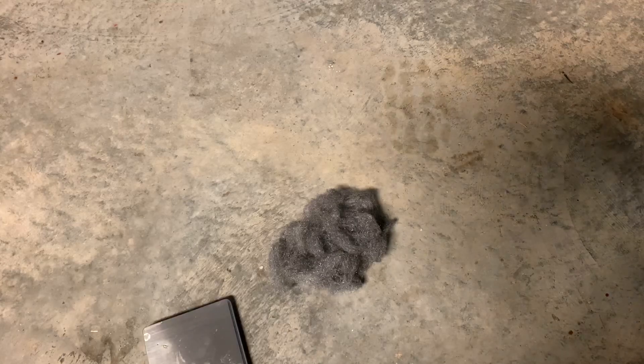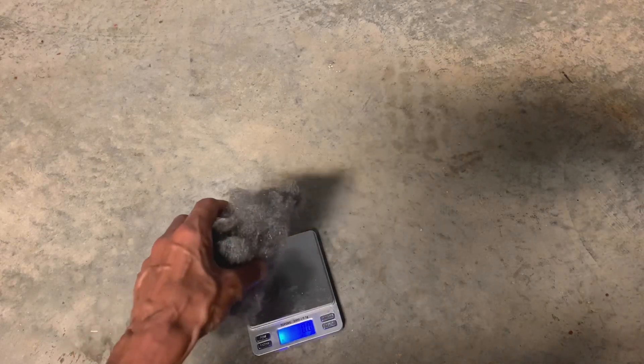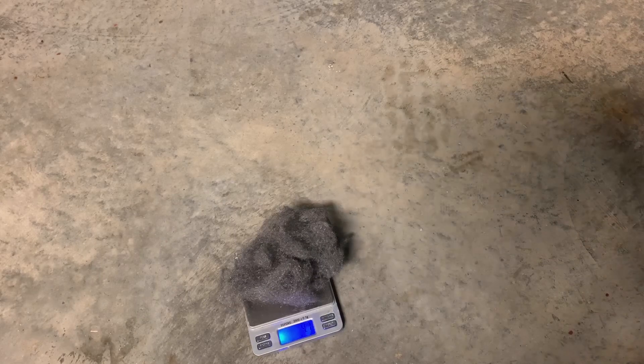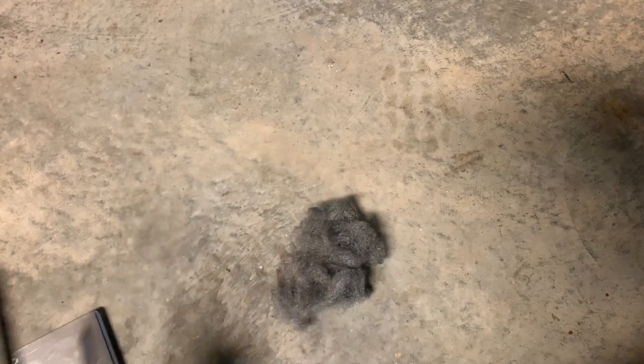First of all, I'm going to weigh it. We have 4.2 grams — it says 4.1 to 4.2 grams. Now with this massively increased surface area of the steel wool, there's much more oxygen in contact with it than with this iron bolt.